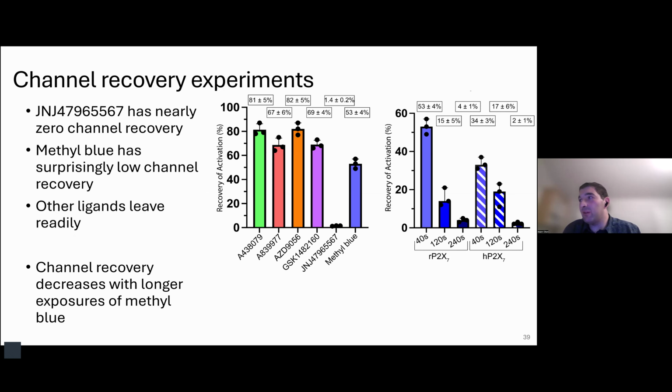So we were curious about the recovery after exposure to methyl blue, and we performed some more recovery experiments at different time lengths. And we see that the longer we apply methyl blue, the less recovery we see. This aligns with the BLI data, suggesting that the ligand has a very slow rate of receptor association, but once it is bound, it also has a very slow rate of dissociation. And this made us very curious to see how methyl blue binds to the P2X7 receptor.